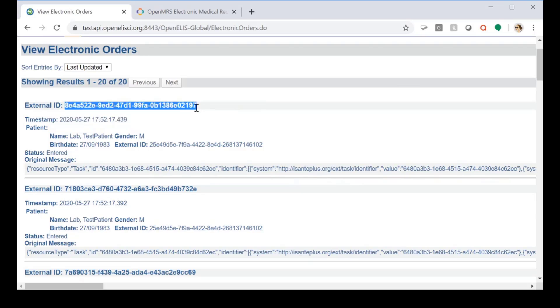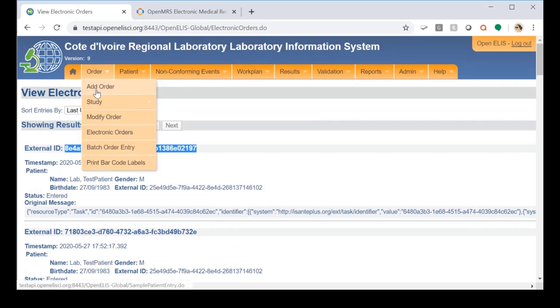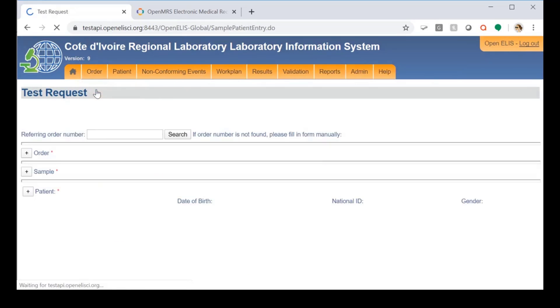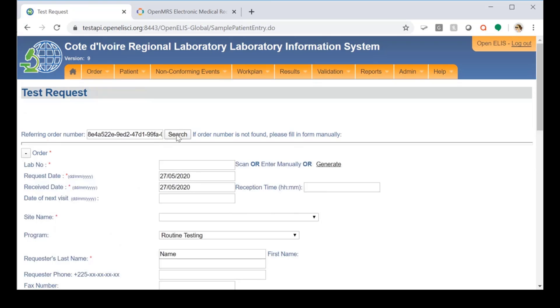So to add the electronic order to the system for processing, we'll copy the external ID and then we'll search for it under add order.